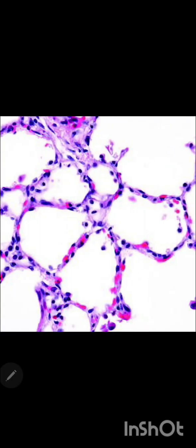How can you identify that this is the simple squamous epithelial tissue? It shows a single cell layer resting on the single basement membrane. Second point, the cells of this simple squamous epithelial tissue are very flattened, just like a plate, and having considerable length, meaning it is somewhat extended in length from side to side, but they are not much in height. So flattened cells are present basically.